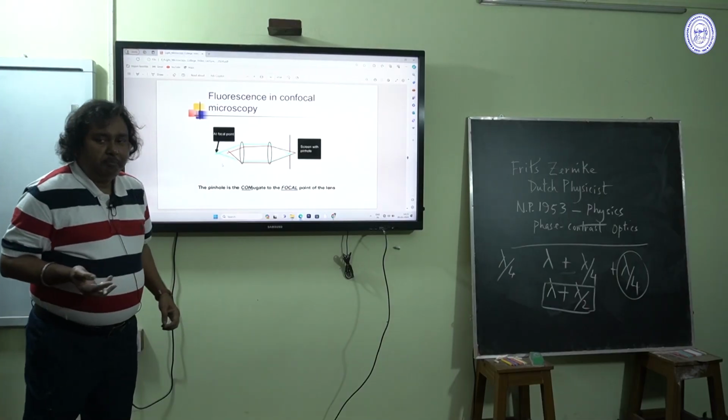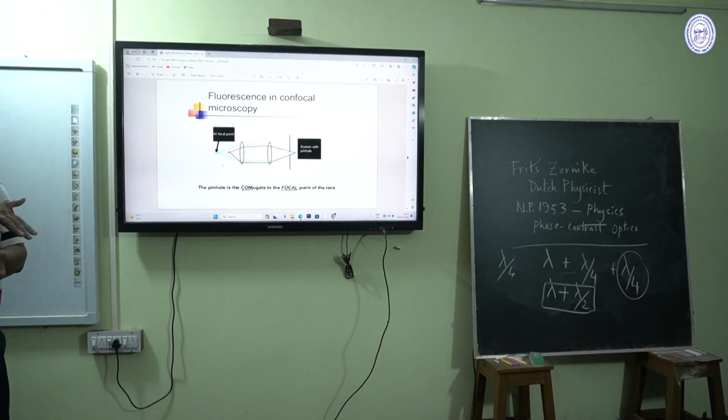This is the basic principle of the confocal microscope. A biological sample may seem two-dimensional, but the microorganism is 3D in structure, and in a thin sample many imaginary or virtual layers are present.